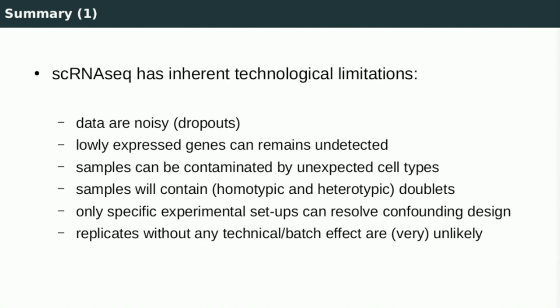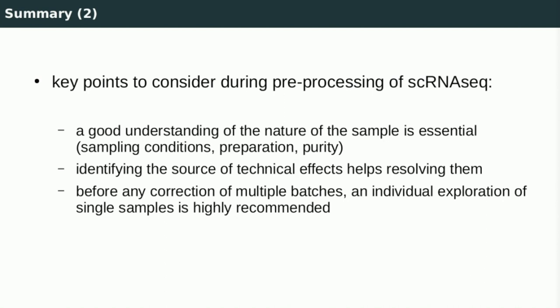In summary, there are inherent technical limitations in scRNA-seq: you will have many dropouts and not detecting a gene does not mean it is unexpressed; samples can be contaminated by unexpected cell types; doublets can occur; and technical batch effects between replicates are very unlikely to be absent. During the process, it is important to understand the nature of sample preparation to retroengineer potential batch effects and correct them accordingly. Before applying any batch correction, always process each sample individually first to understand the stress and limits applied to each sample.